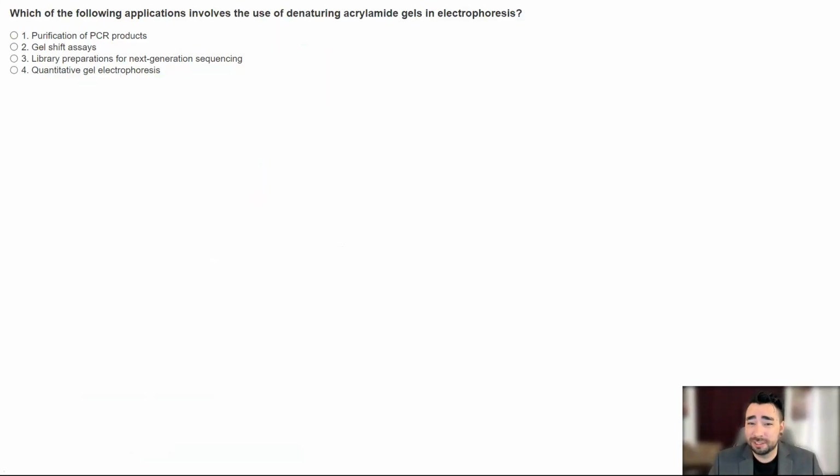We would appreciate your participation by answering a few polling questions. To record your answers, click the options on the screen. Our first polling question is, which of the following applications involves the use of denaturing acrylamide gels in electrophoresis? 1. Purification of PCR products. 2. Gel shift assays. 3. Library preparations for next-generation sequencing. Or 4. Quantitative gel electrophoresis. I will now give you a few moments to select your answers.